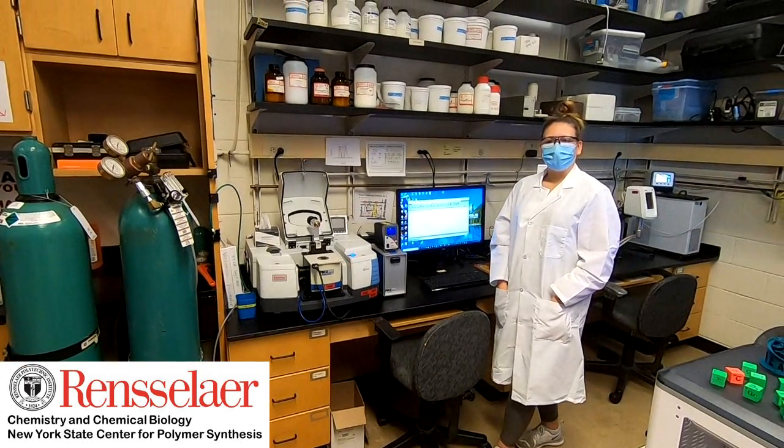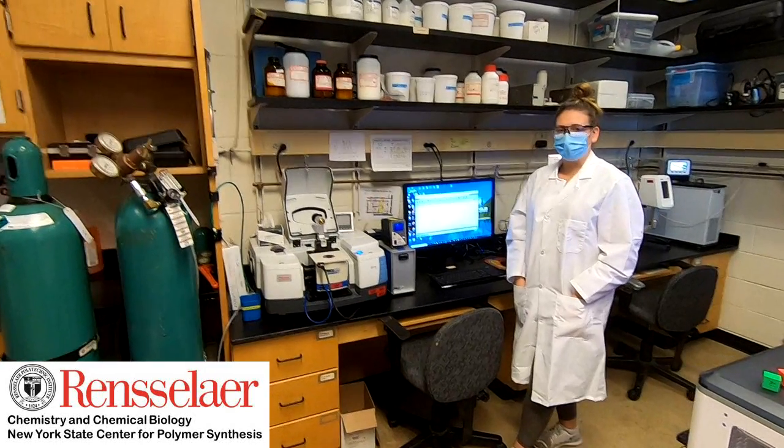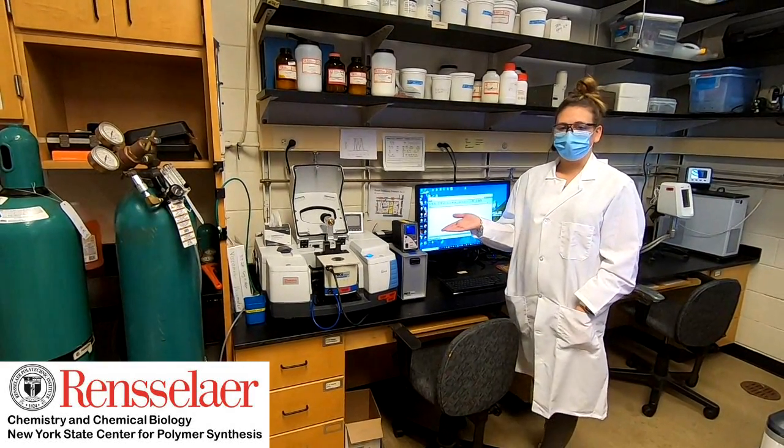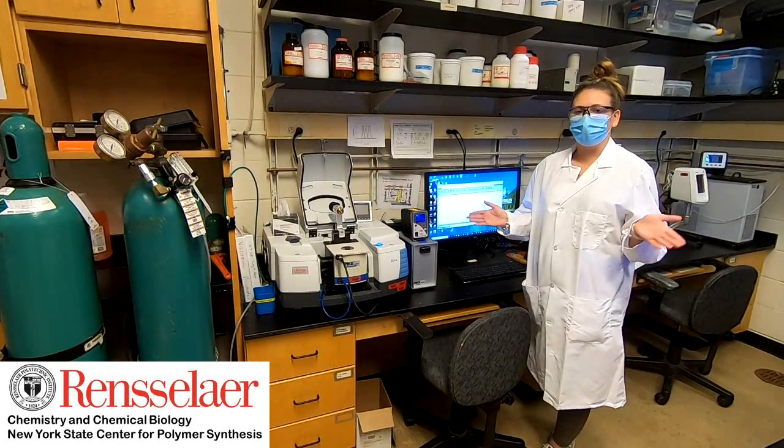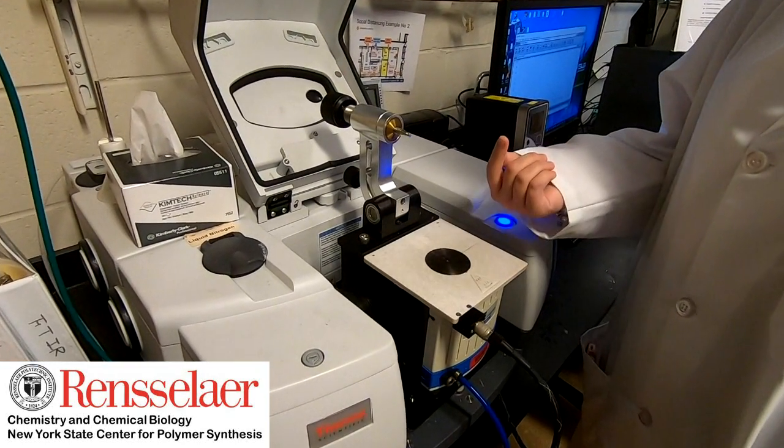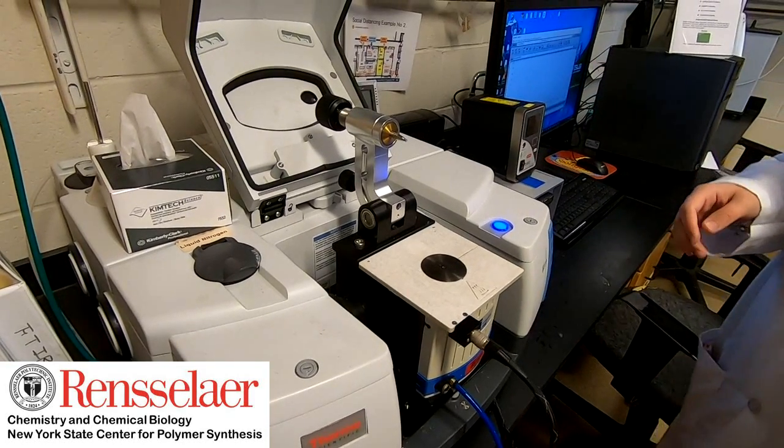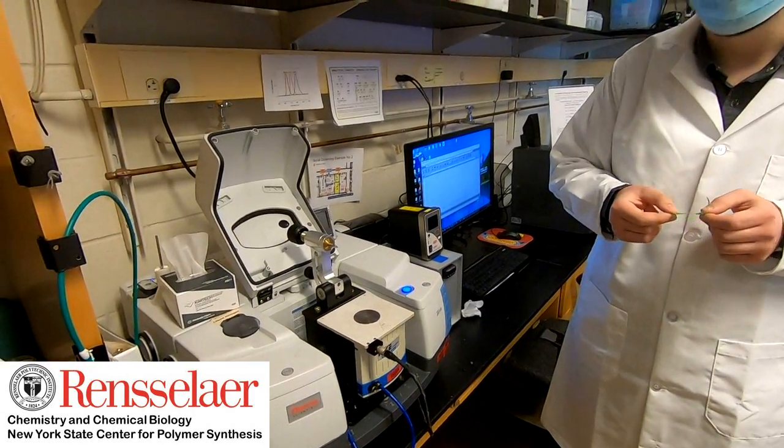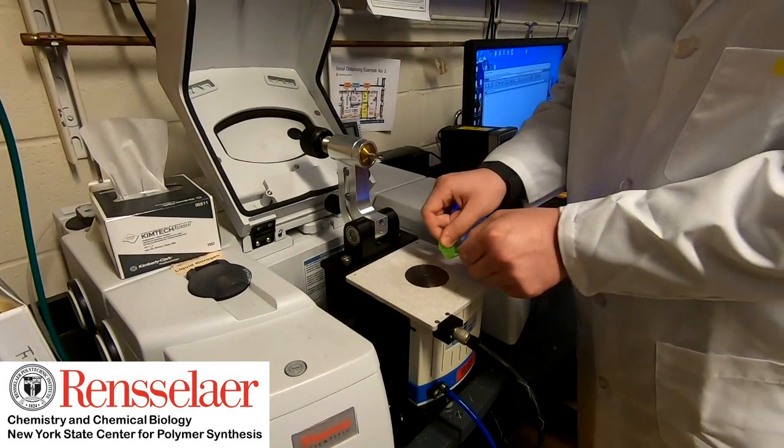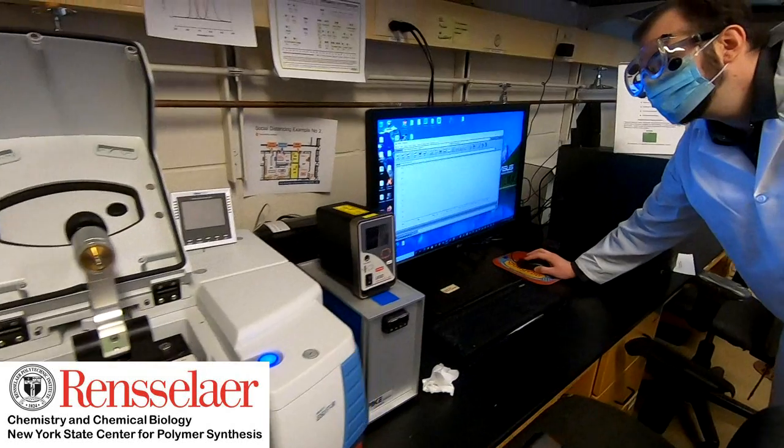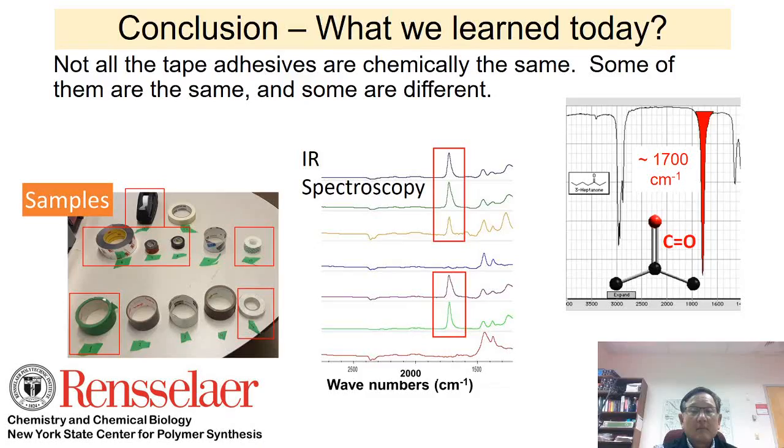Hi, I'm Lauren Zarzatzky. I'm a second-year PhD student at Rensselaer Polytechnic Institute. Today, we're going to talk to you about FTIR, or Fourier Transform Infrared. This is our spectrometer right here. Basically, this instrument allows you to examine the fingerprint spectrum of any compound or substance you want. You would put your sample right here on the center of this platform, and the IR beam would come up from underneath and scan into your sample to produce your spectrum on the computer. We're going to measure adhesives found on common household tape. All you have to do is put it above this sensor here in the middle, and then we can run the IR spectra.